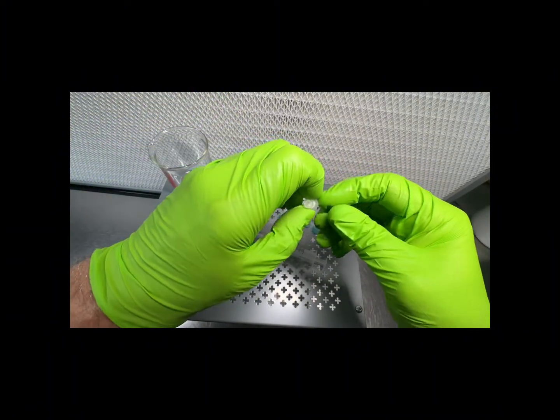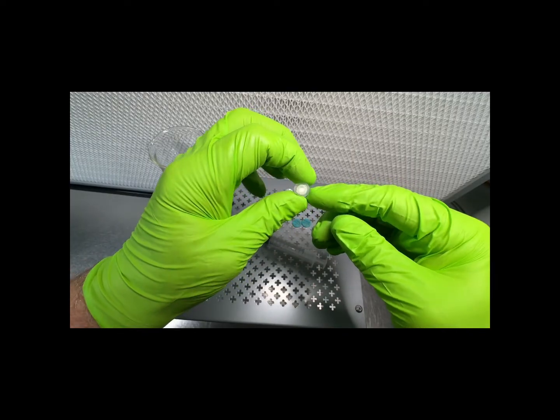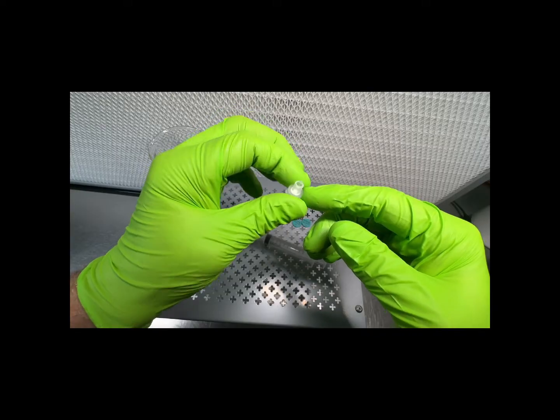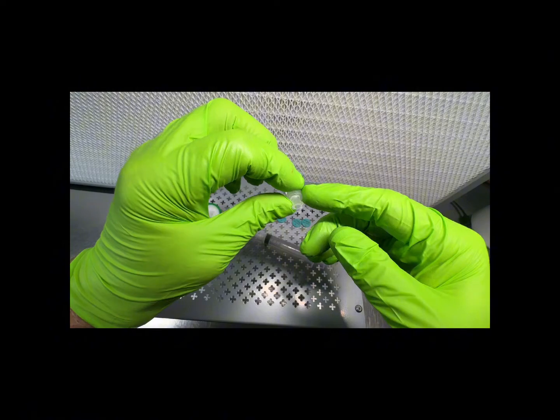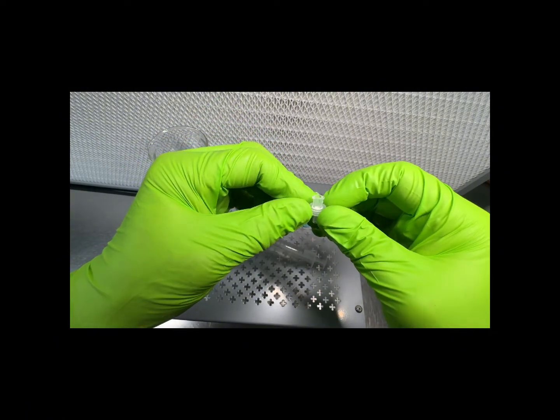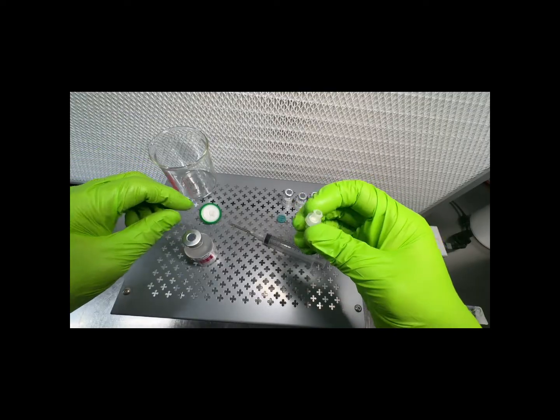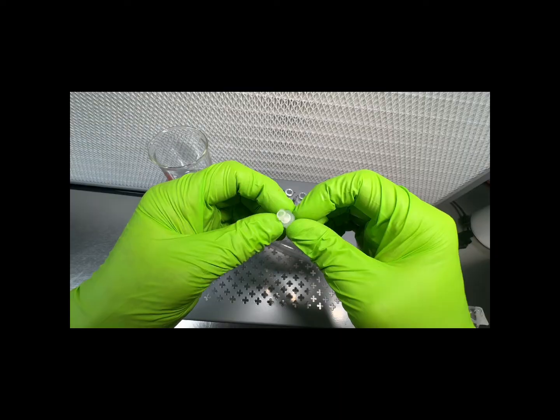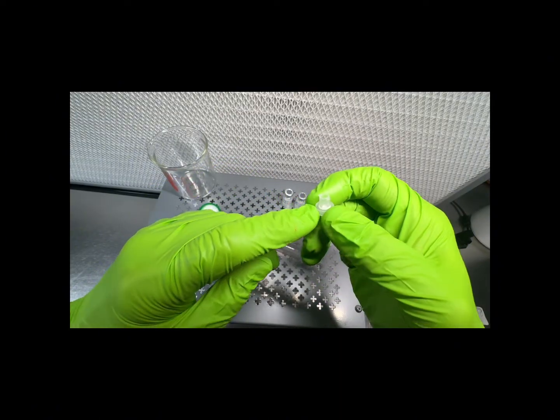So there are a lot of other sizes and membrane types that are available. We like the PES for the high flow rates and the low protein binding, which means that you are not going to have your peptide get absorbed by the filter itself. And we like the 4 millimeter size just because of the amount of peptide that gets effectively stuck in this housing right here. This is the 4 millimeter.